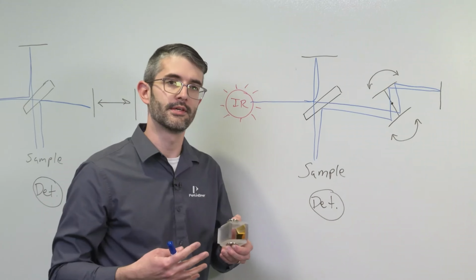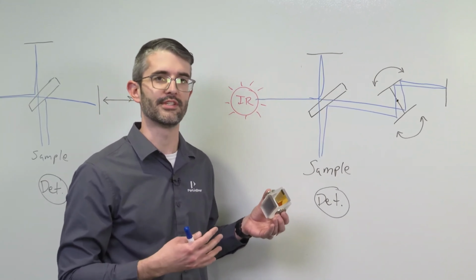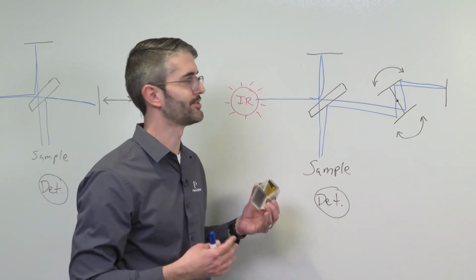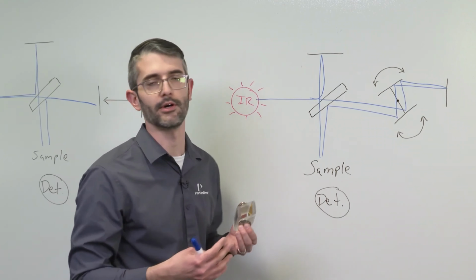Why is this important? It's important because the elimination of those artifacts actually improves the scan-by-scan measurement quality, allowing you to address challenging analytical measurements with confidence in the quality of your results.